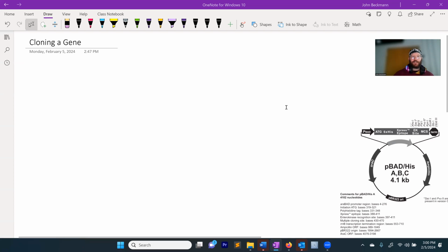Okay, today we're going to do it a little bit different. So we're starting module 3. For module 3, I kind of need to use a computer. So I'm going to do my best to teach you guys on the computer and record via Zoom. Hopefully everything will work out okay.